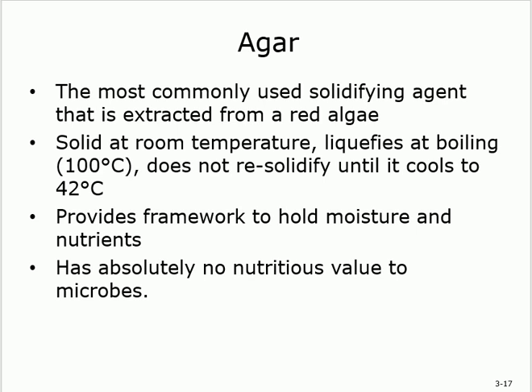Agar is solid in room temperature, but you can liquefy and you can solidify. You can change. The numbers here are important to remember. This is agar. I add it to the medium. What exactly is going to happen? Can I play with the physical state? Can I change it? Yes, you can. How?